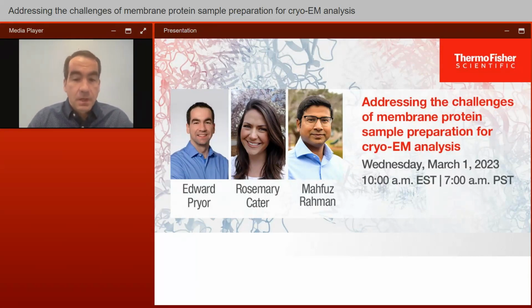Our first speaker, Dr. Mahfuz Rahman, is an R&D Staff Scientist at Thermo Fisher and will be presenting the overall workflow of single-particle cryo-EM sample preparation, specifically discussing the challenges of membrane protein sample prep and sharing strategies and best practices to improve the success rate of sample preparation and obtain high-quality cryo-EM results.